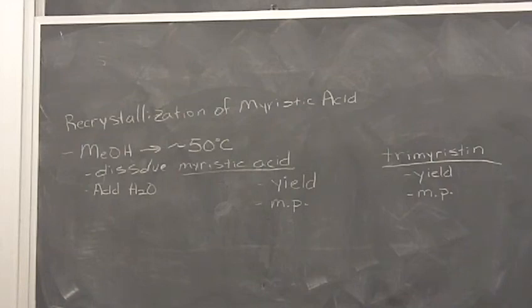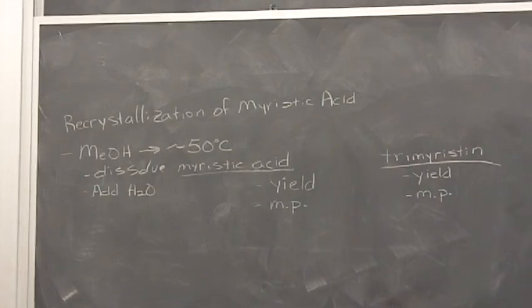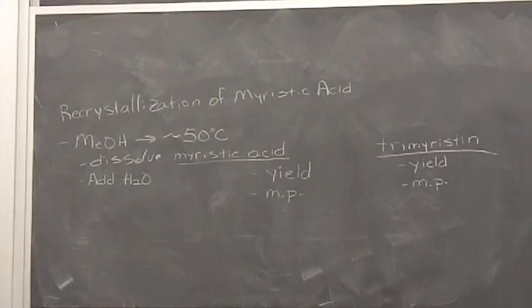What you want to do is take a little bit of your trimyristin, a little bit of your myristic acid, mix those together, and they should have a depressed and broadened melting point range, just like would have happened in experiment 1 if you picked the wrong acid, okay? So because they should be different solids, you do the mixed melting point to confirm that they are different solids, all right? So it's opposite of experiment 1.